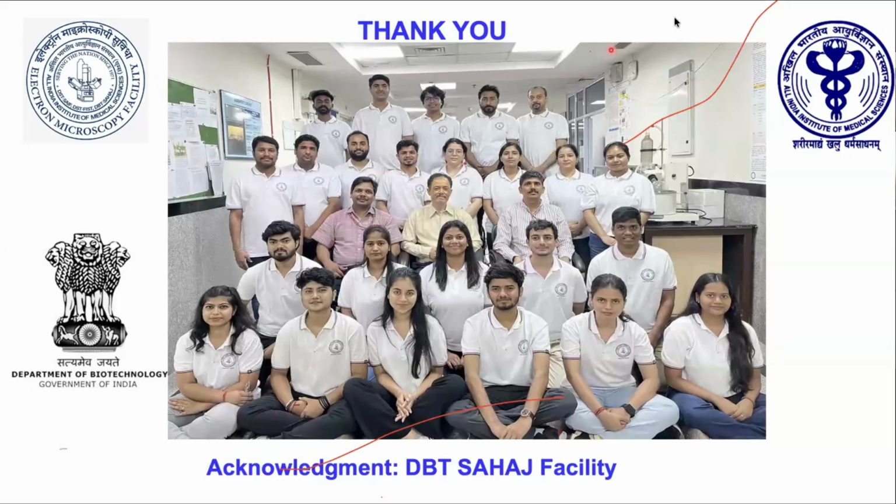Okay, so we have one question, from Nandini. Would you recommend adjusting the GIS layer or sputtering coating to reduce artifacts during cryogenic slice and view? Yeah, but you have to see what type of sample. If you have a much thicker layer, we also get the problem.